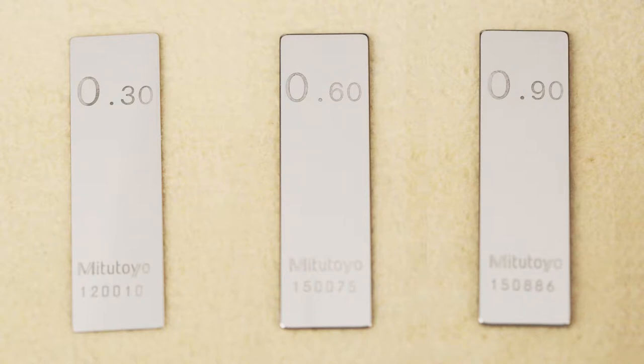These gauge blocks are precision components made of steel with a certification of traceability to NIST. For a DMA1 displacement adjustment, you will need the following: three gauge blocks.